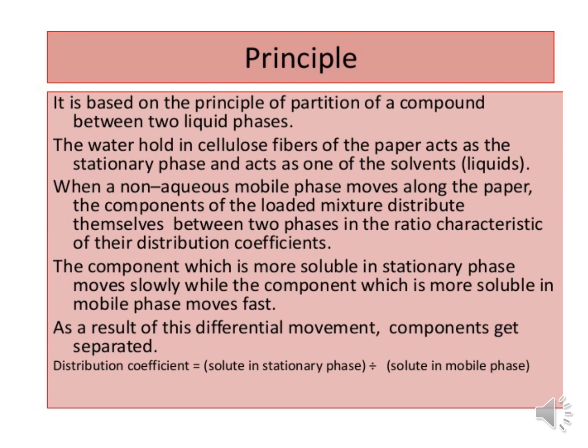Here, the mobile phase is an organic solvent and the stationary phase is water adsorbed on the surface of the paper. Alternatively, the paper may be impregnated with anhydrous silica, alumina or ion exchange resin. Here, partition occurs as a consequence of solid liquid or ion exchange equilibrium.